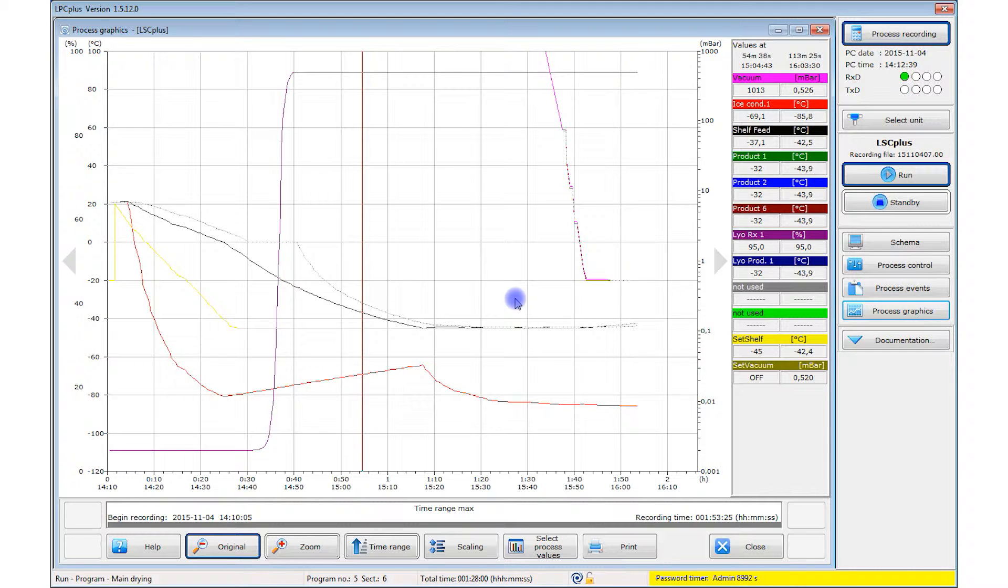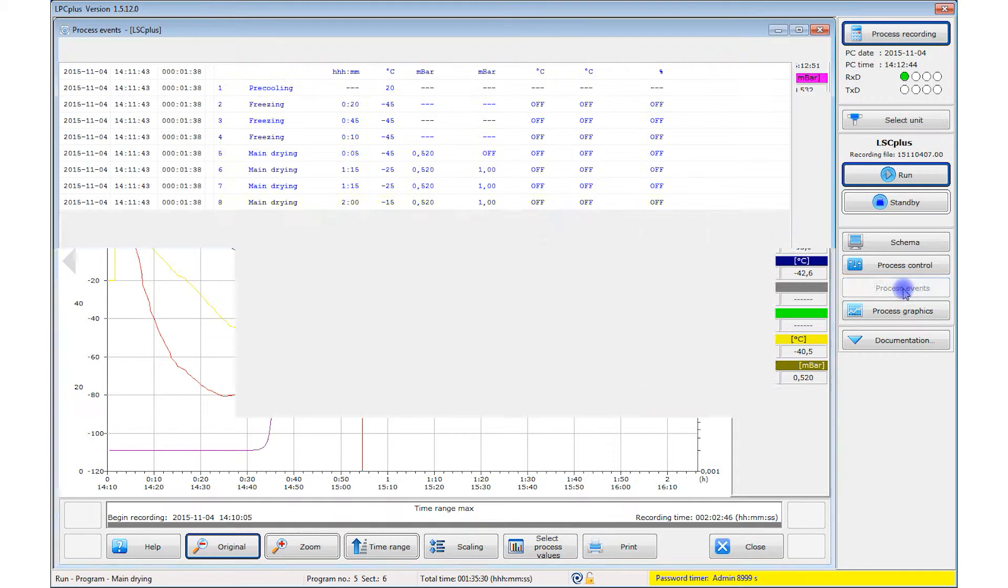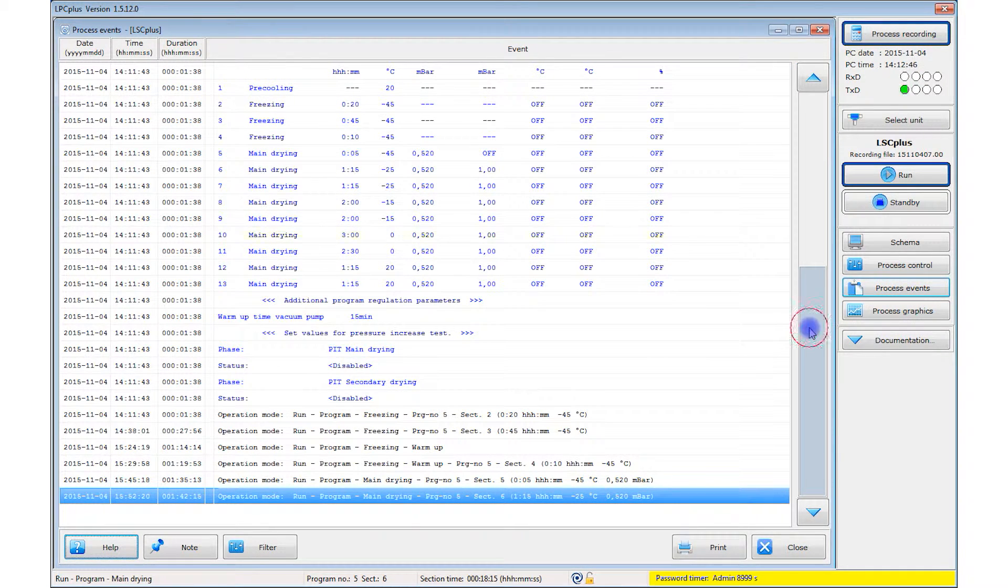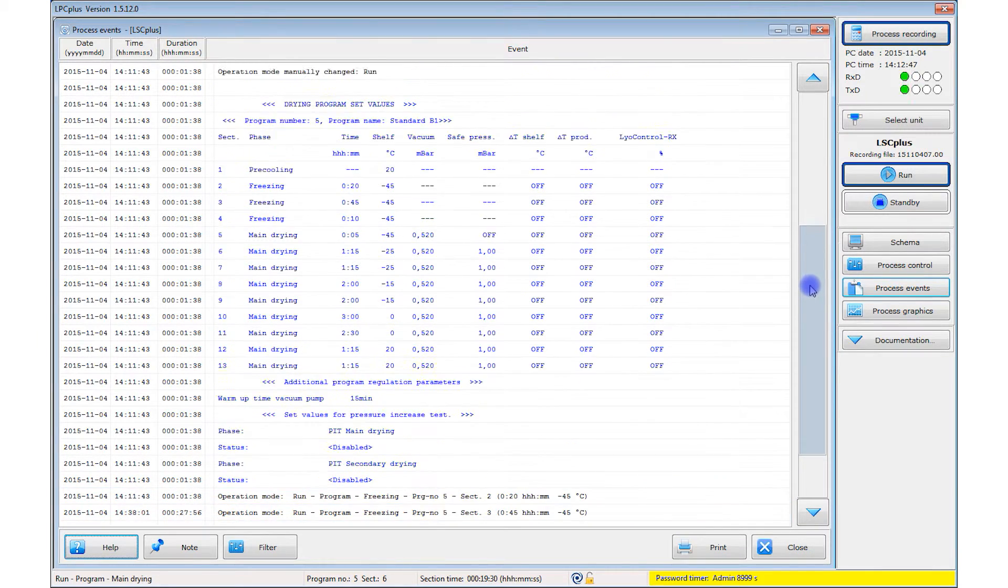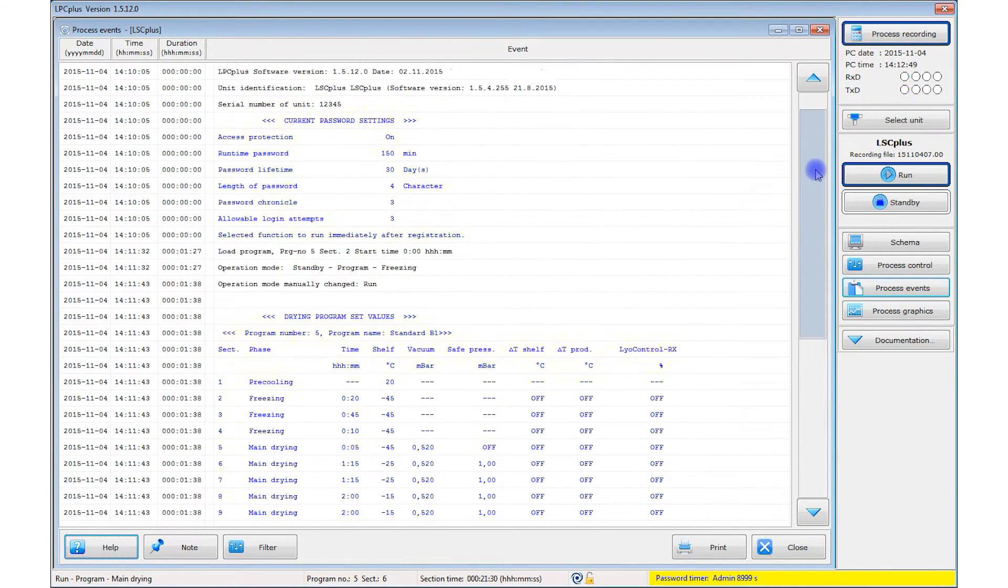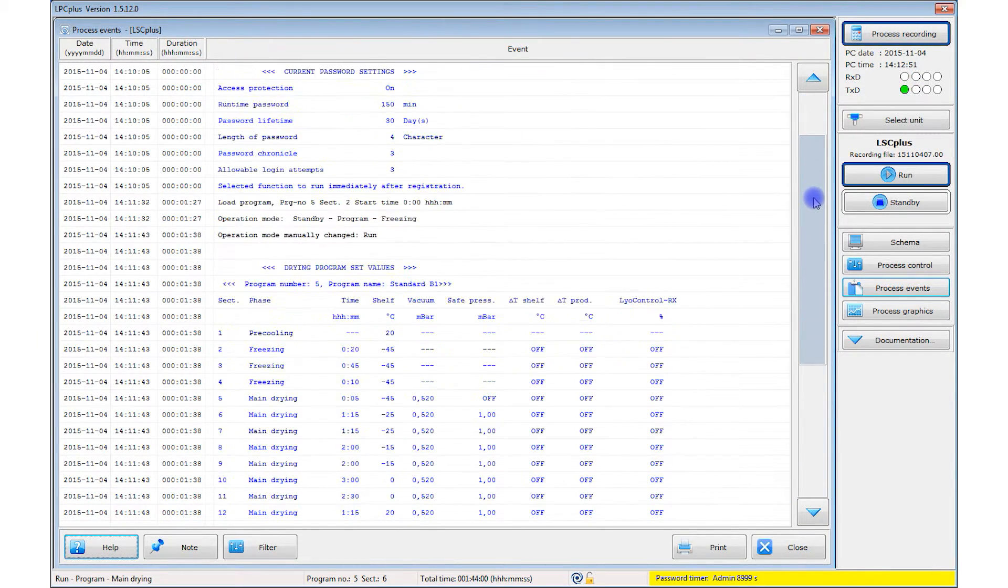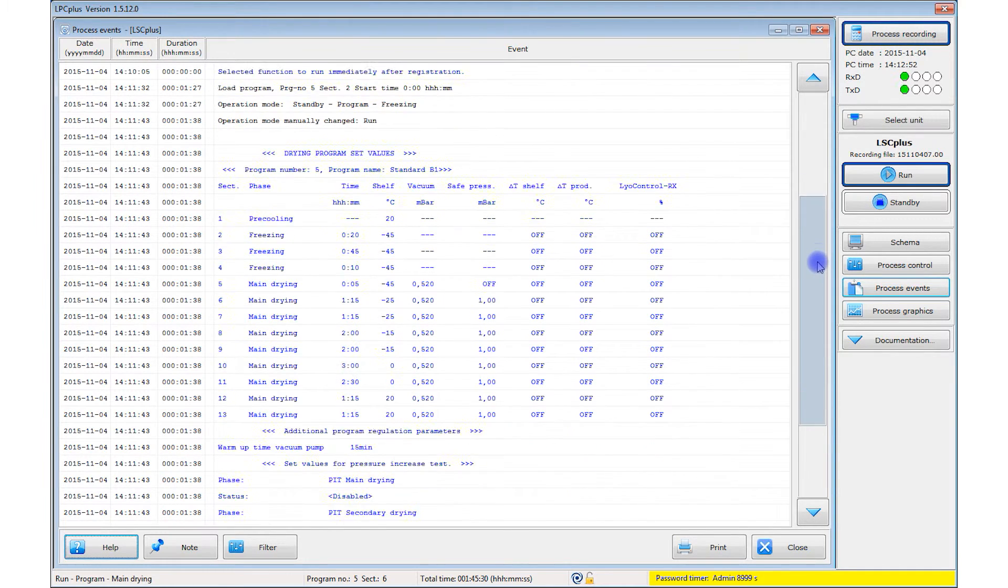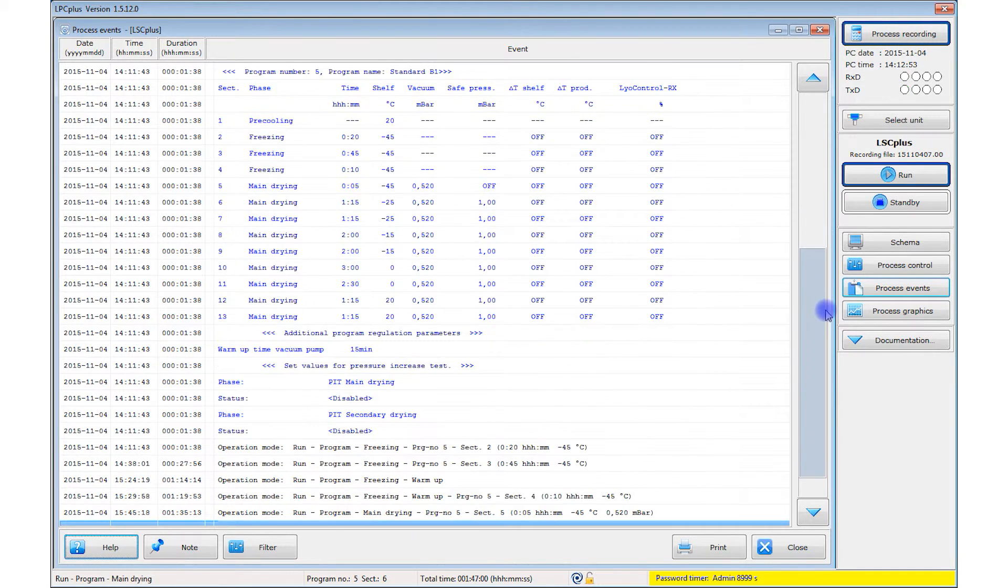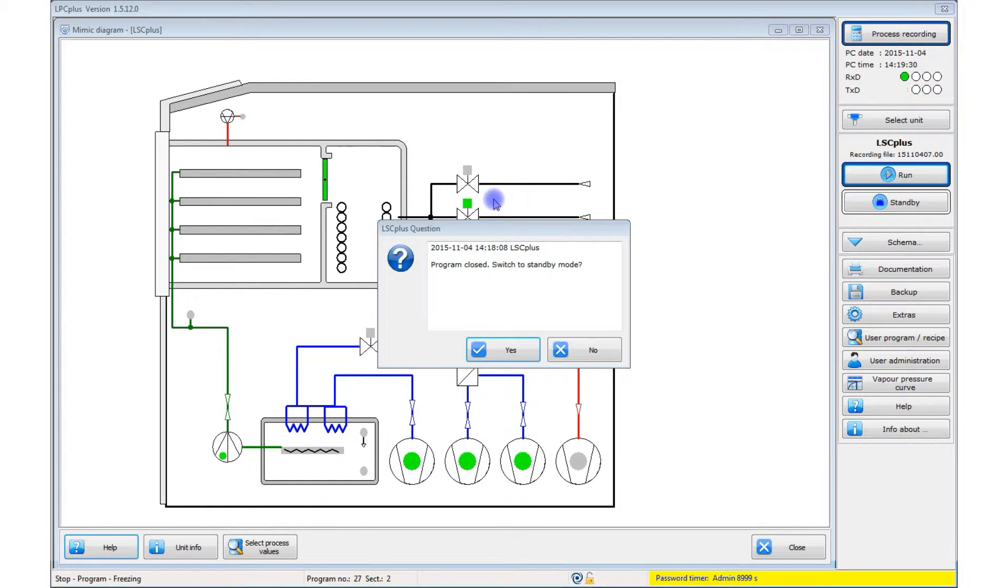Along with the process graphic, the software can display a process events list containing all data related to the system and the process, along with all messages and alerts with corresponding timestamps. Once the freeze drying program has finished, it has to be terminated.